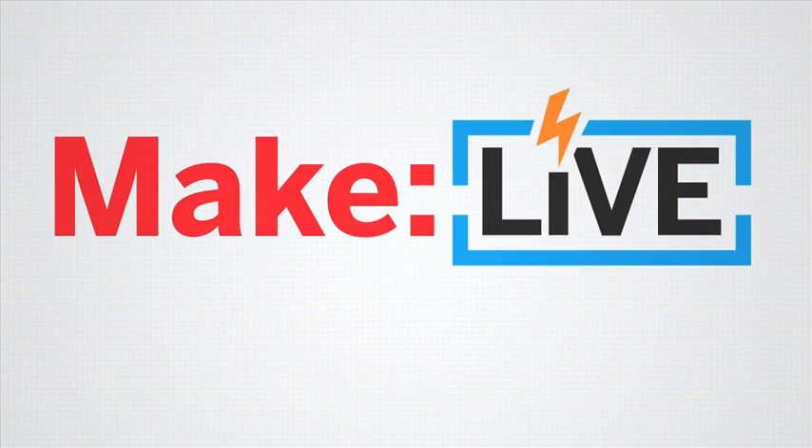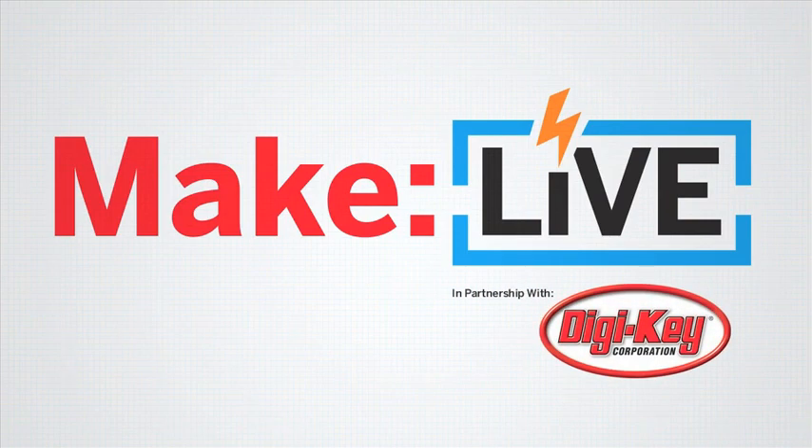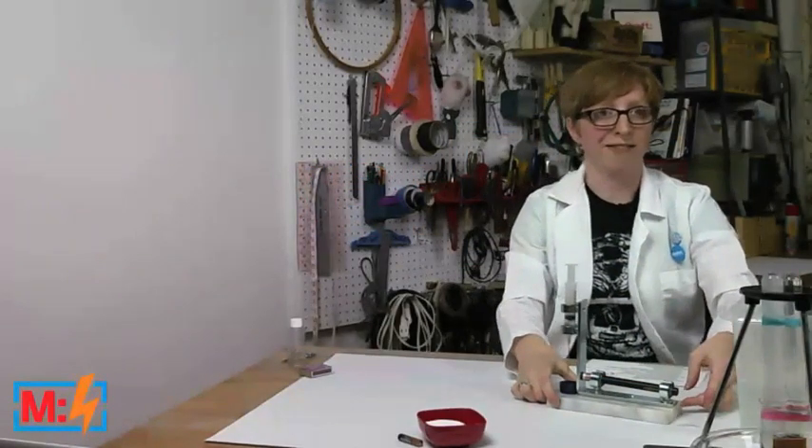This episode of MakeLive is brought to you by DigiKey. So what have I got here in front of me? It's actually an incredibly simple system.